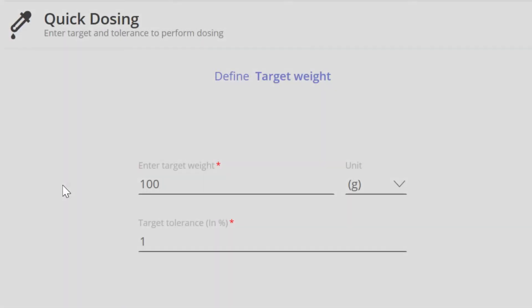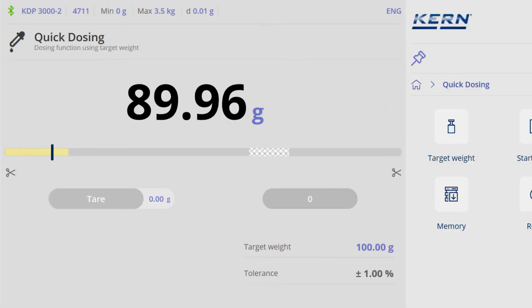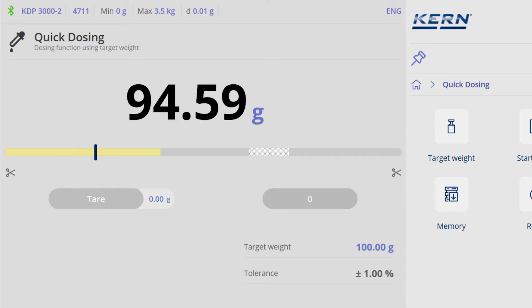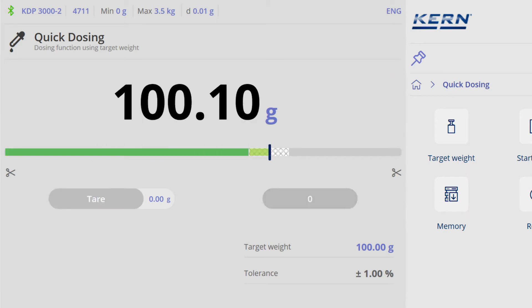Specify target weight, accept tolerance or redefine, precise weighing thanks to the dosing aid, and finish. Accurate dosing can be that easy.